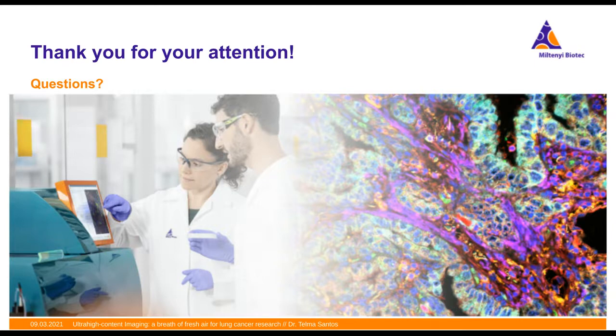In this particular case, as I showed in one of the slides, it was just one region. So in the Adenocarcinoma, we had about 18 fields of view, and in the Squamous cell carcinoma, it was about 16 fields of view.